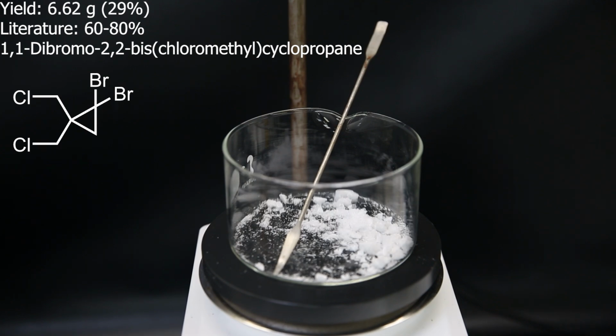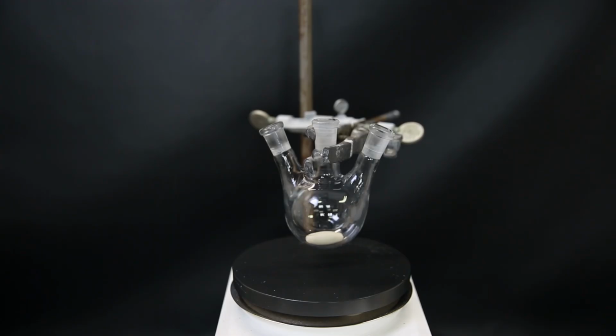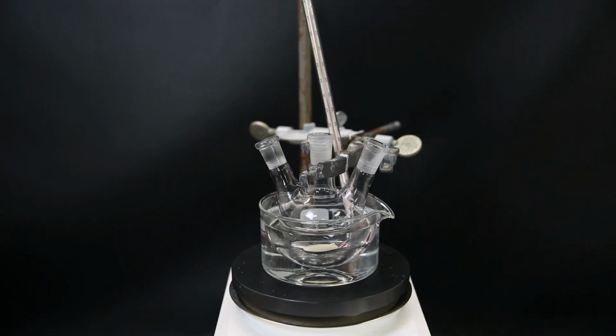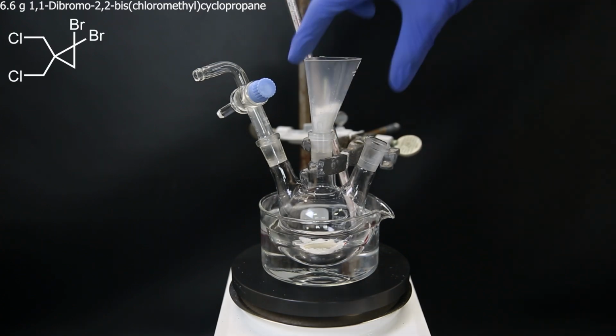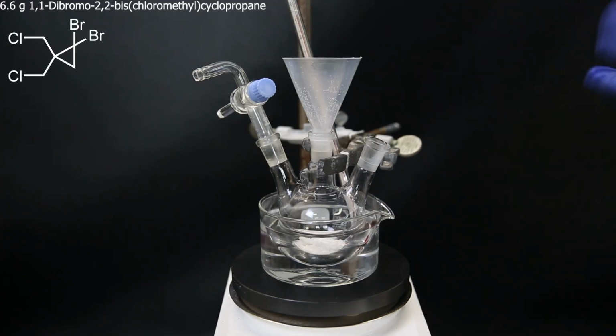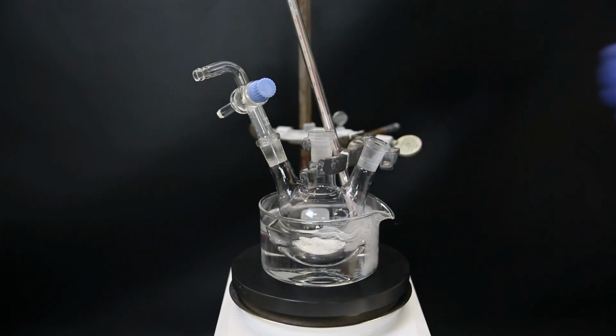Anyhow, now I will use all of it in the final step to make [1.1.1]propellane. So I set up a small 3-neck flask with a stir bar and put it in an isopropanol bath with a thermometer. I attach a gas adapter and a funnel, and then put in all of the product from before. I then start cooling down the bath by adding in dry ice.